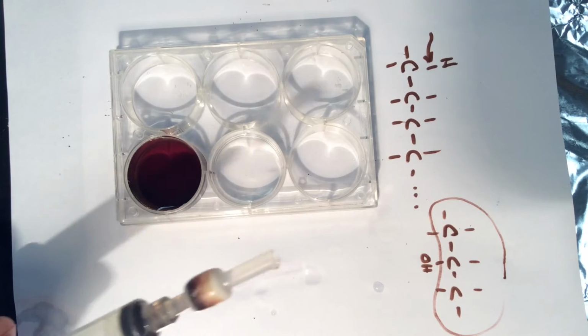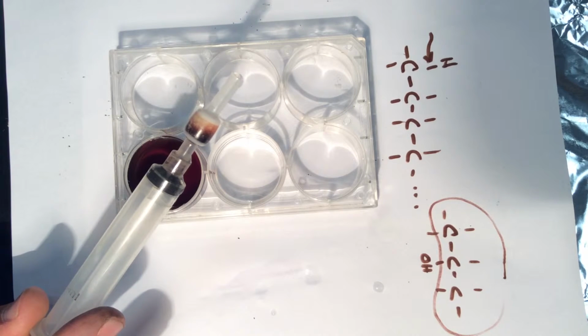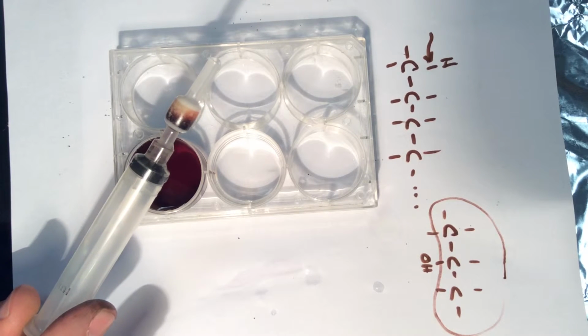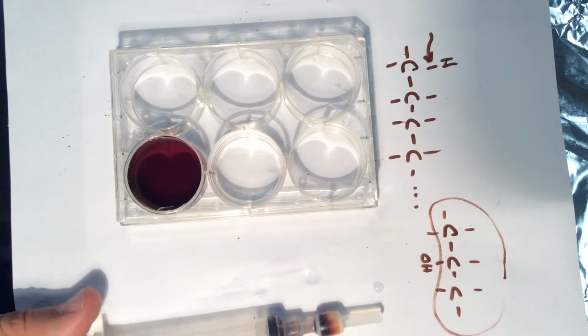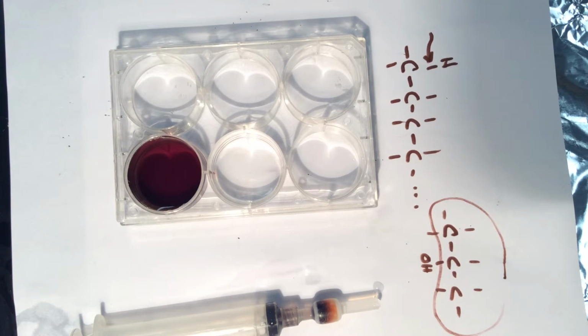Okay, now we're not done yet. I want to separate the red from the blue. As we've learned before, the two molecules we're dealing with here, the red 40 and blue number 1 industry names, they're different molecules. They'll have different solubilities. And a mixture always retains its individual properties. So what I'm going to do is take a 5% solution of isopropyl alcohol.